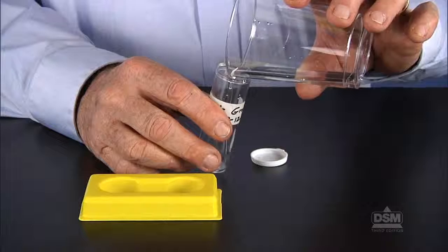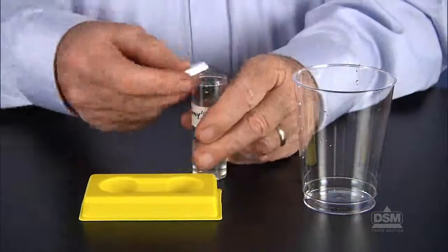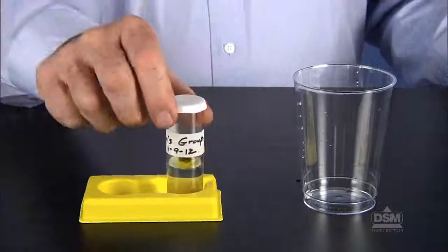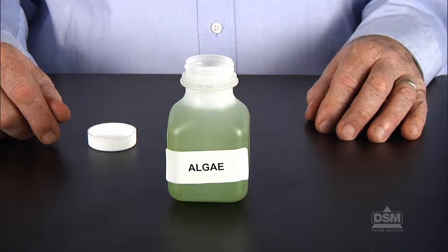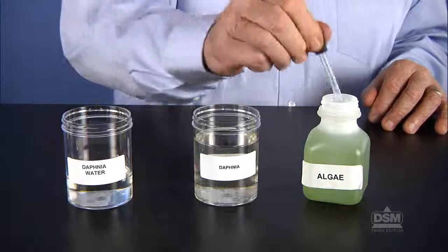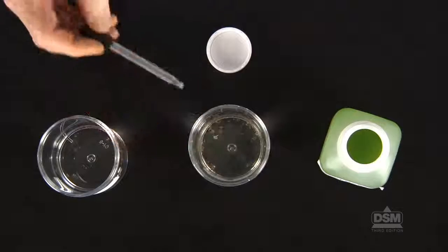Finally, pour the contents of the container back into the vial. Then, have students place the vials in the vial holders and store them out of direct sunlight and away from heat sources. Remove the lid from the algae container and place in a spot where it will receive light but not direct sunlight. To replace water that evaporates and to provide food for the Daphnia, each school day add 1 dropperful of extra Daphnia water and 1 dropperful of algae water to the large Daphnia culture in the shipping container.